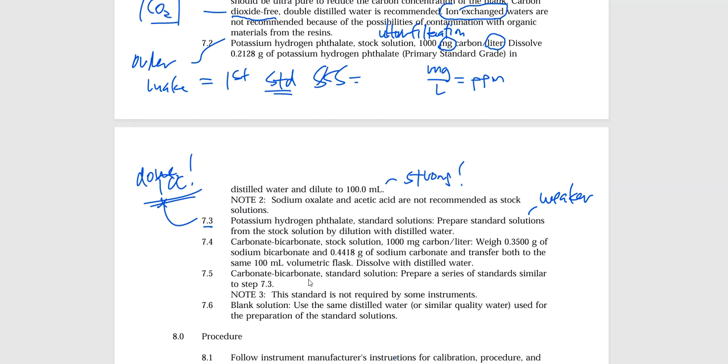And, you know, great job. Great job, Shimadzu. Great job. You made my life a little bit easier. The problem, though, is that when you make the 1000 ppm up here at the top, this is still way too strong for that machine to use to make the standards with. So we're still going to do one dilution, and that one dilution, we're going to go down to a 50 part per million. When we go to a 50 part per million, then that's great. That's what we need to do. And that is what the machine is going to be using to make the rest of the standards with.